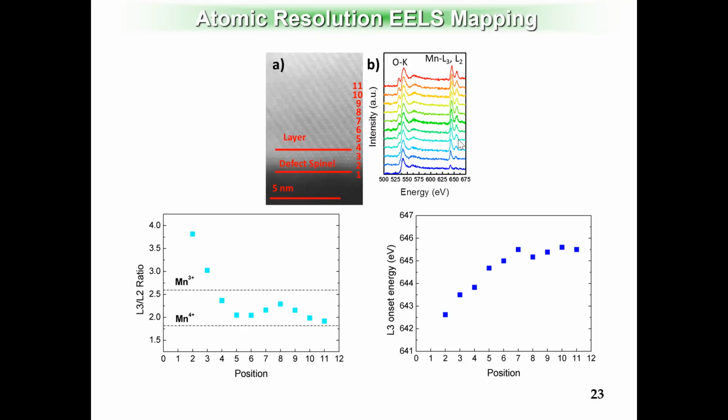You can quantify the L3 to L2 ratios, and then you can see how this transition metal changes throughout my surface and my inner subsurface regions, and so forth. And you can correlate with any disorder regions or defect regions generated on my surface. It can be generated during the synthesis or after electrochemical cycling, but that's nice because you have both structural information combined with chemical information, right?